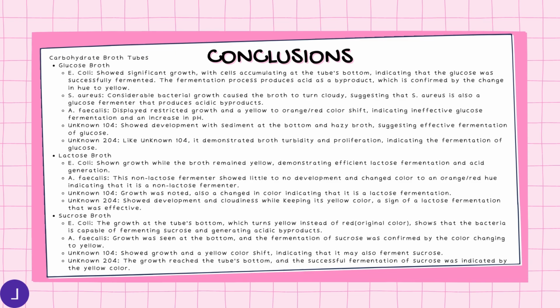And for both of our known unknowns, we see growth, we see glucose fermentation, and this can be compared to the E. coli and the A. faecalis growth. It's pretty much around the same.